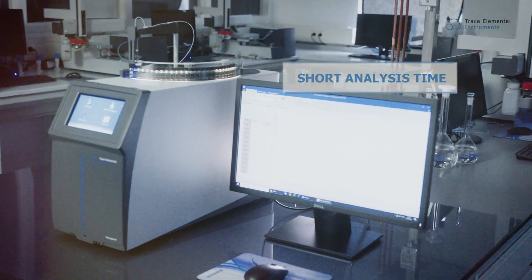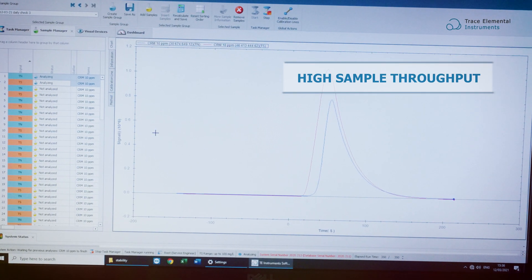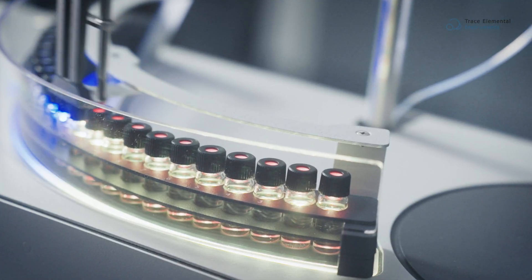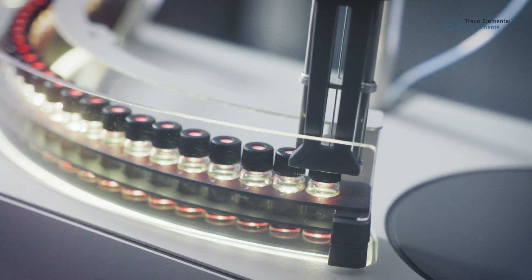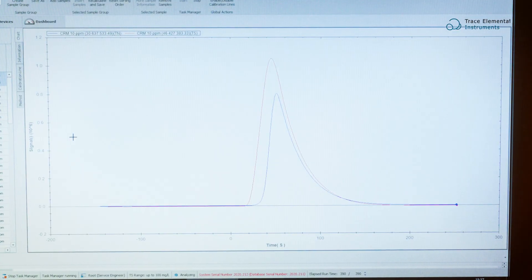Short analysis time allows you to achieve high sample throughput and fast, reliable results. Waiting for results is history with an analysis time of less than three minutes per injection.